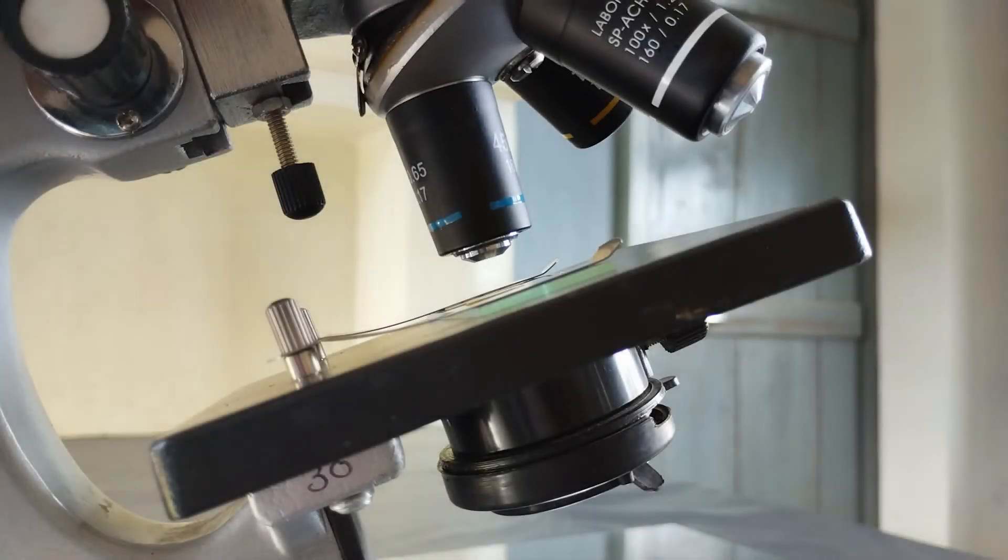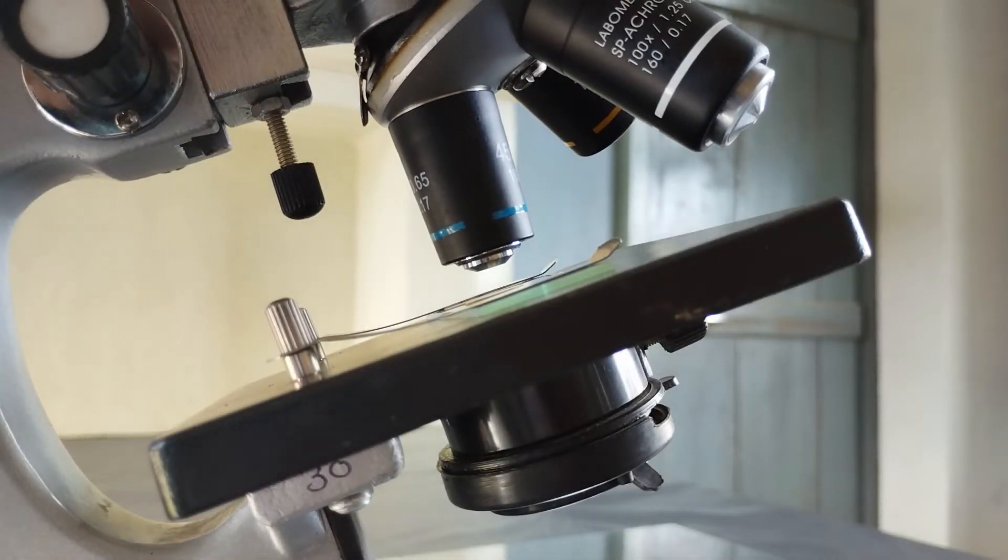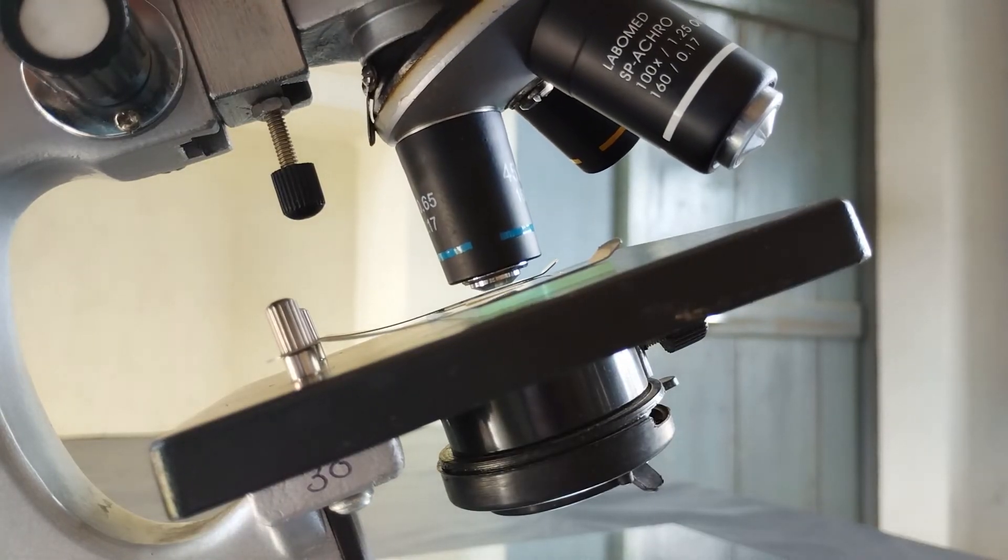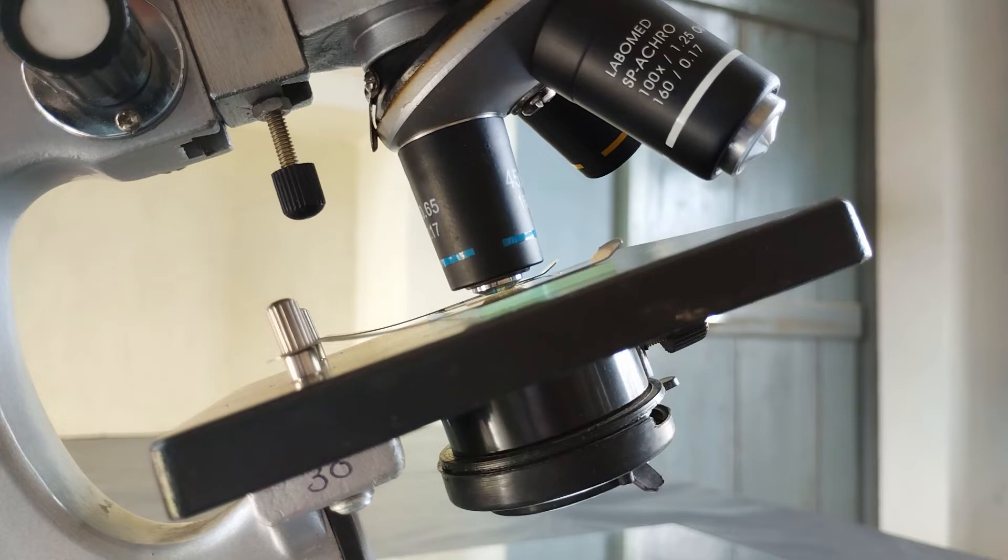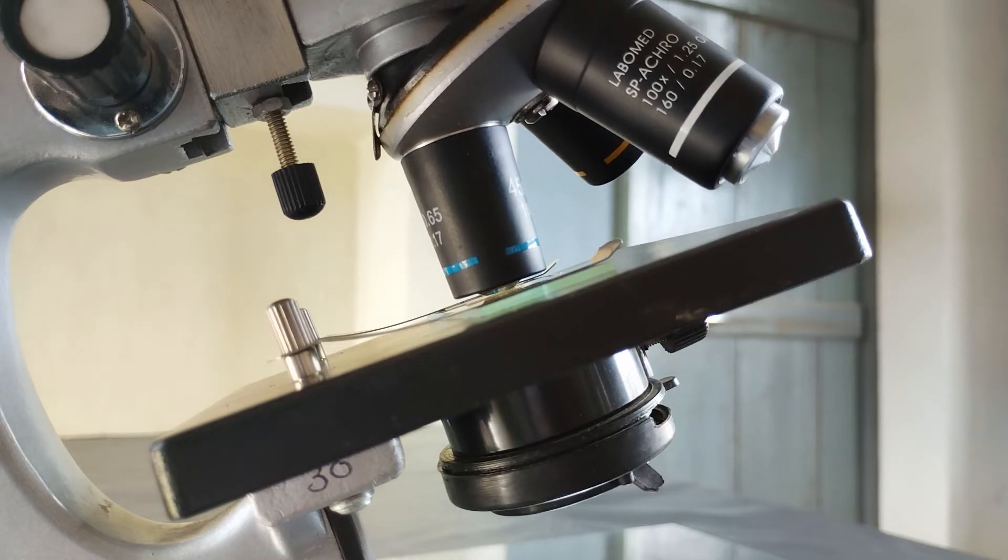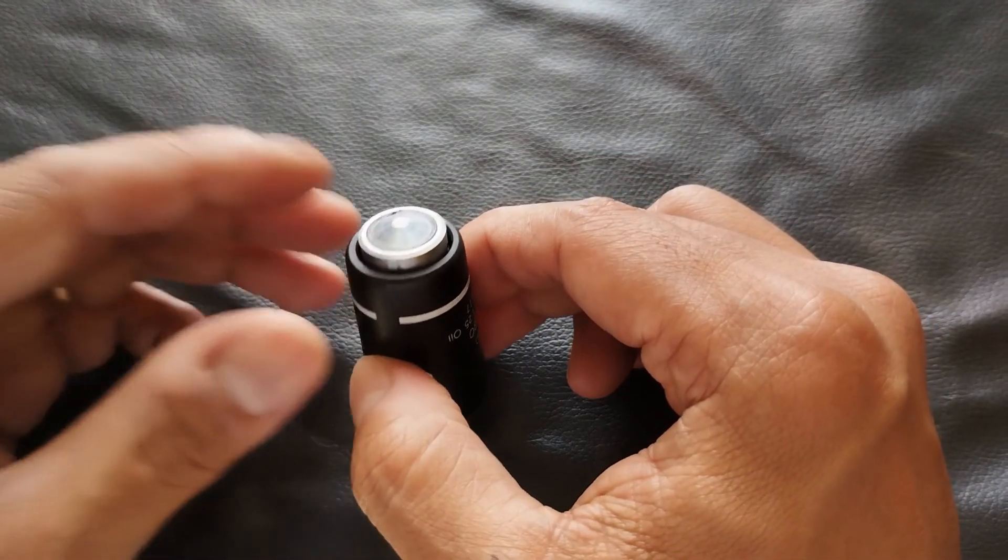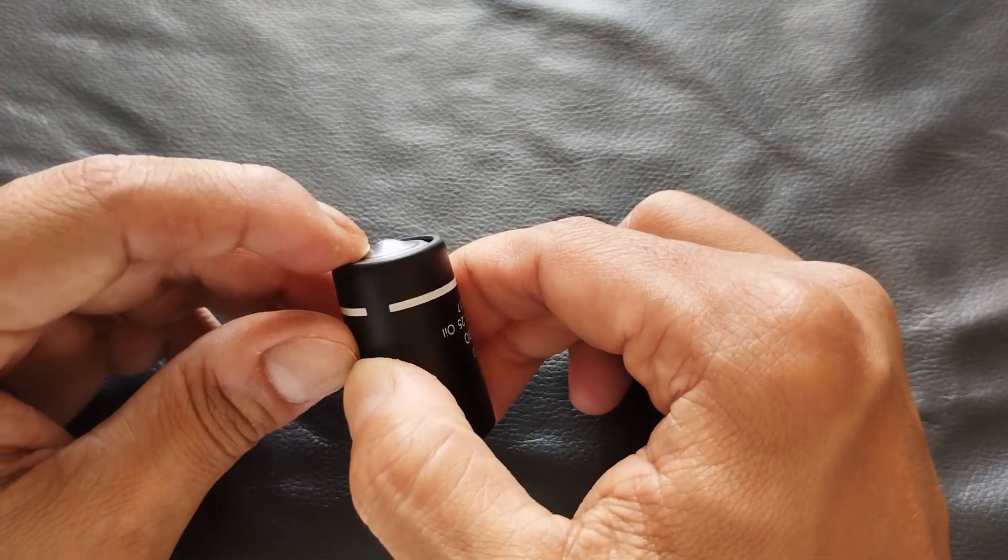To prevent this mishap, many modern high power objectives are manufactured with a spring mechanism fitted for the front lens. These spring-loaded objective lenses help prevent accidental breakage by retracting the front lens to a certain degree into the body of the objective when the user happens to overshoot the lens against the glass slide.